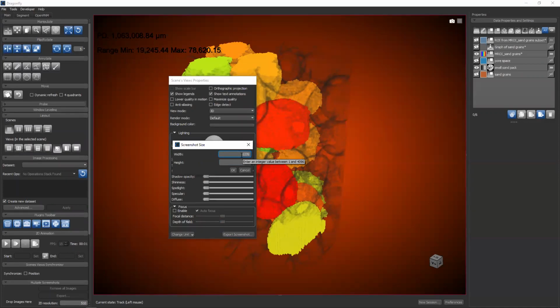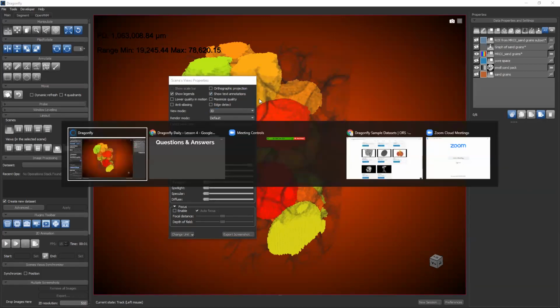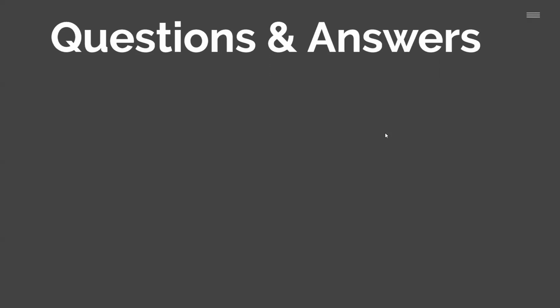So if you have a 4K monitor, you could enter whatever, 3076 by 2048. I'm sorry, I don't know the actual numbers, but you could dial in. So I'm going to answer the question that way. If you have a follow-up question, ask me and ask in the forums or something.